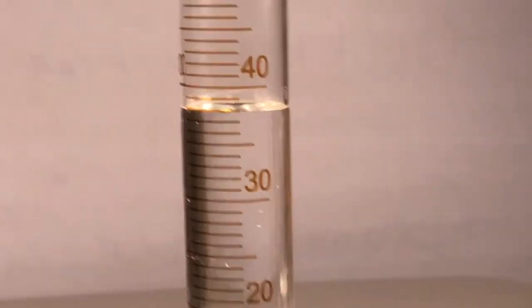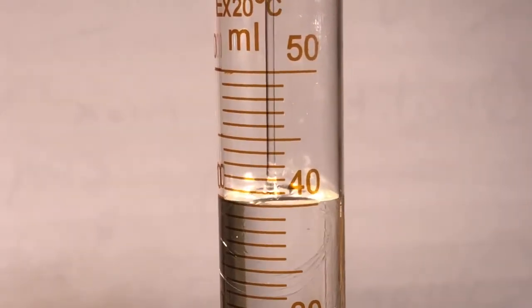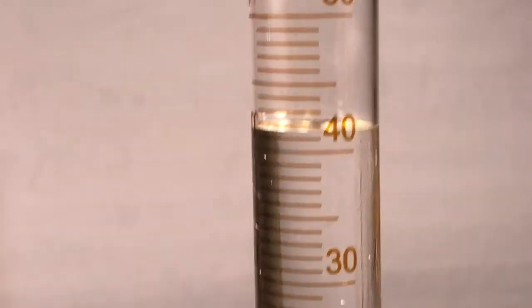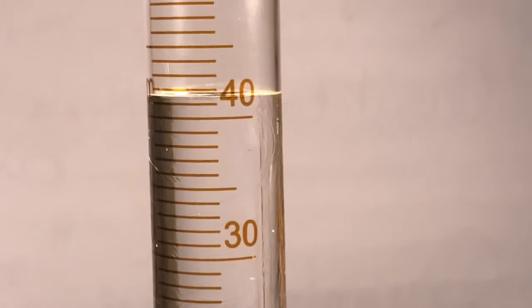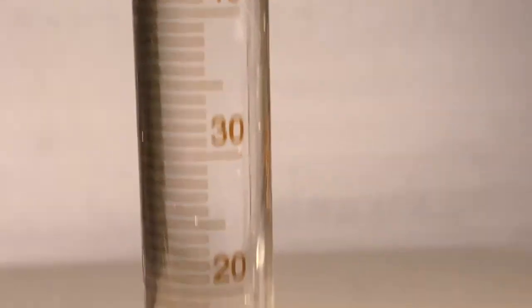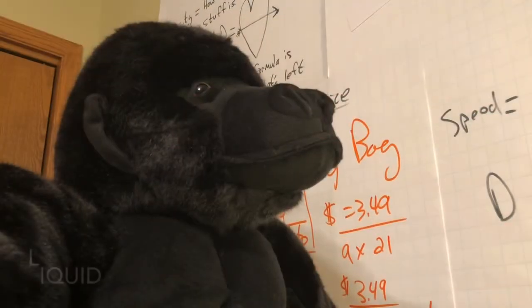And here comes 8. Oh my gosh, I'm losing my mind. I think this is 8. I'm pretty sure it's 8. Okay, guys, it'll still work if I don't give you the same number. It'll still work just fine. Got it? And mass. Oh, that's liquid 2.